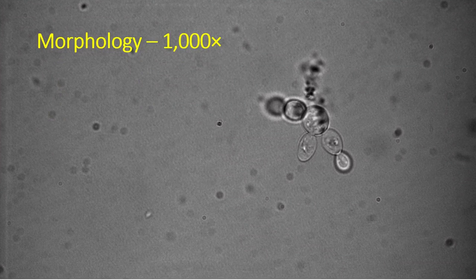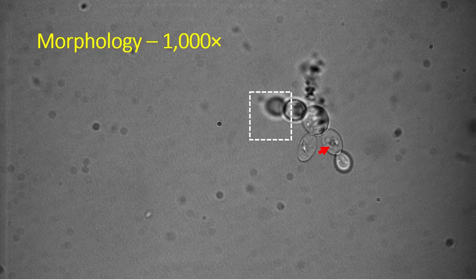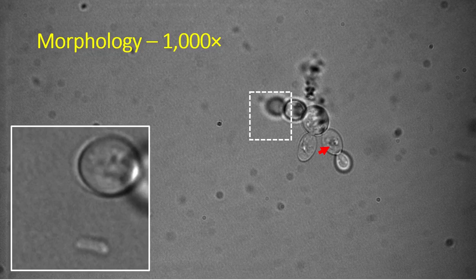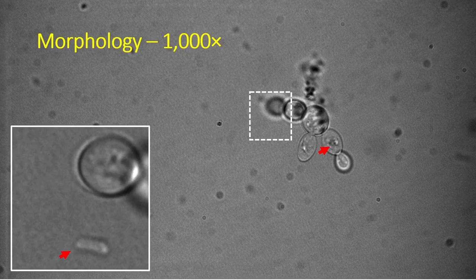Here's 1000x, and you can see there's a lot more detail obvious in yeast cells. Here again is a mother cell and a daughter cell, and very clearly they are connected — not just two yeast cells stuck together. We can also start to see some internal structure in the yeast, such as some vacuoles. If we adjust our focus and zoom in, we can see something else quite important: a single bacterium. It's quite clearly a rod-shaped bacterium — not two cocci or two circular bacteria stuck together. So at 1000x we can see enough detail on bacteria to tell apart basic morphological characteristics, such as rods versus cocci. That's enough, for example, to tell Lactobacillus apart from Pediococcus.